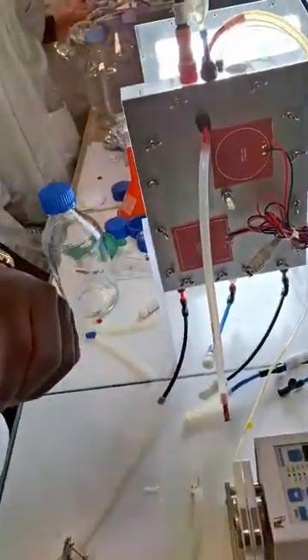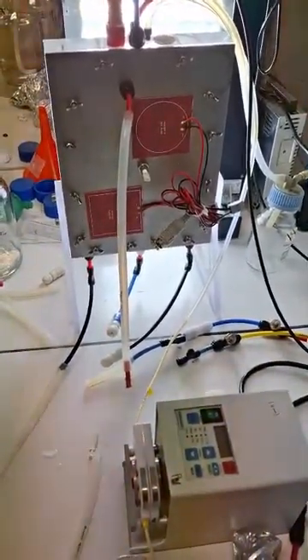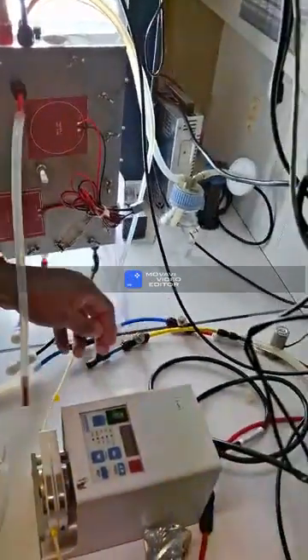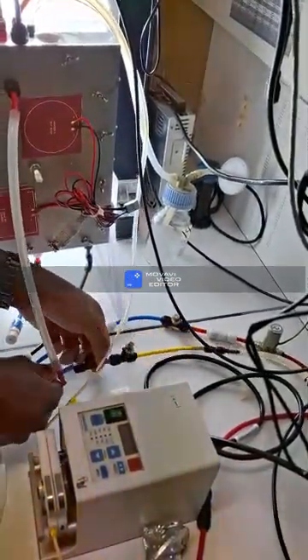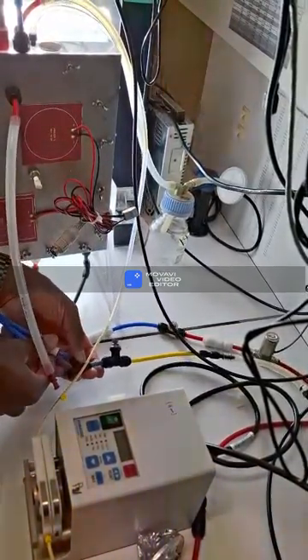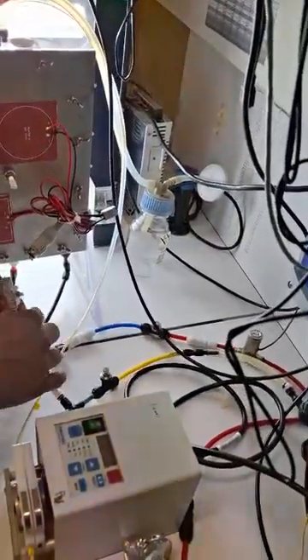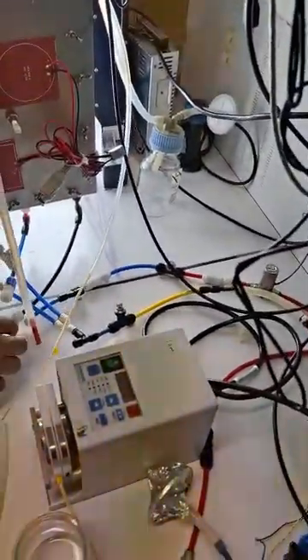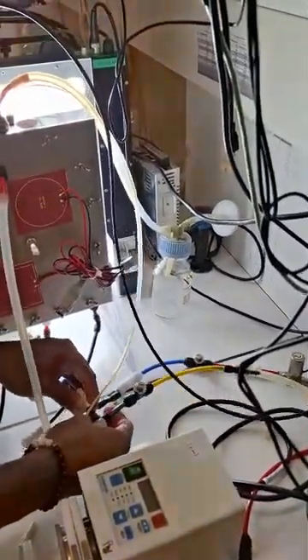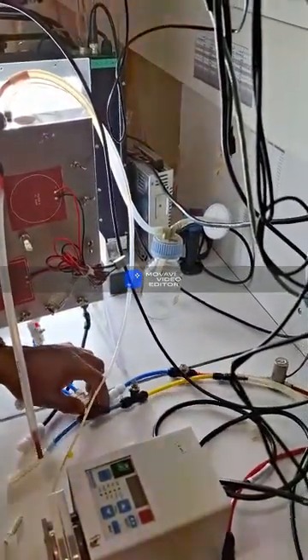Is it possible to see how much carbon dioxide we have supplied? No, not because we have this regulation, but we don't know how much pressure of carbon dioxide we have. I agree, but normally to do this you need a flow meter. Yeah, but we don't have it here. So it means if there is excess carbon dioxide, it would not be a problem for the photobioreactor?